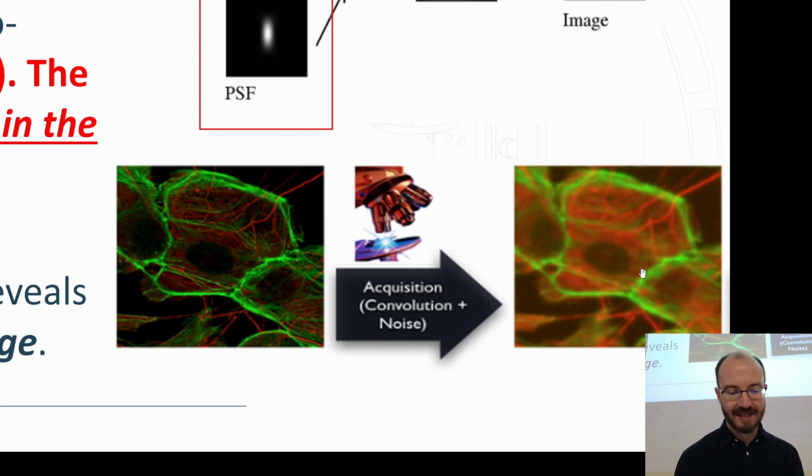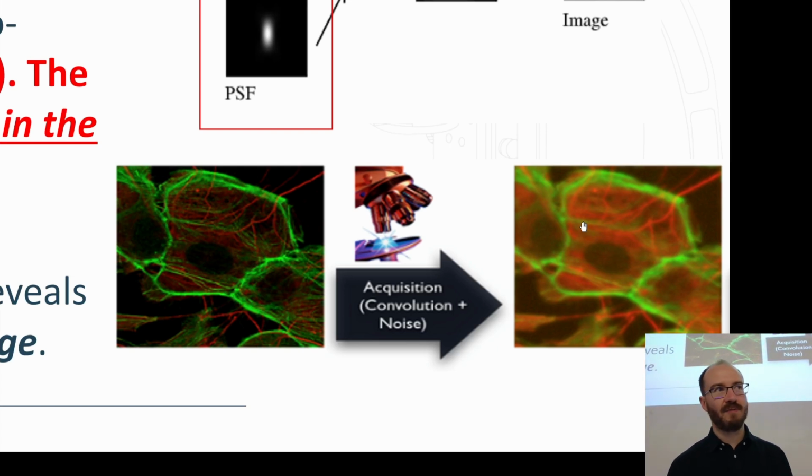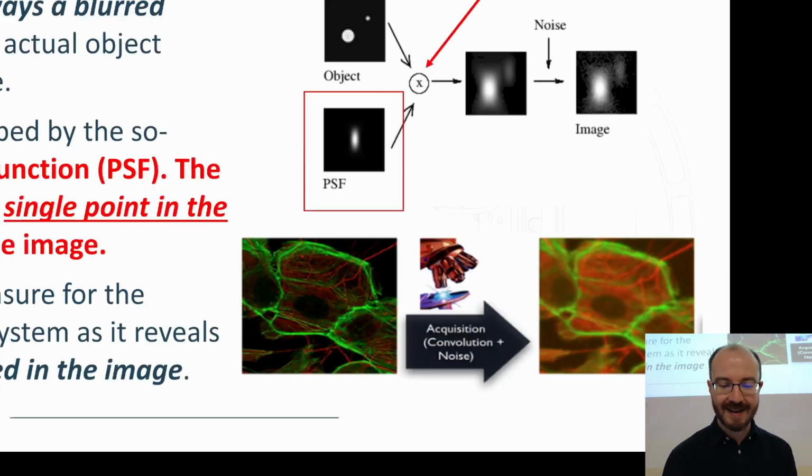That's obviously not very desirable or ideal, but the great thing is we can model the amount of distortion that the microscope introduces. Shot noise, for example, is difficult to model because it's somewhat random, but the distortion that the microscope brings into your sample is fairly consistent. There can be slight variations depending on the oil, the objective, temperature and other factors, but in a general sense, it's pretty consistent. So if we model this distortion, we can mathematically undistort it, because we know what function was added, and we know how to unadd that function.